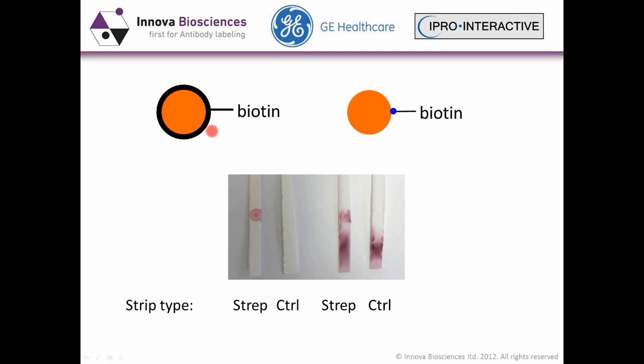This is an example of Innova coat biotin gold versus a ligand self-assembly biotinylated gold. We have a streptavidin spot on the nitrocellulose versus a control with no spot. The biotin gold binds to the spot very cleanly with no background. Whereas with the self-assembly, where dissociation or destabilization occurred, you can see the aggregation and purple color of the gold even before it reaches the spot — and even on the control, there's significant aggregation. This can be reduced somewhat by optimizing buffers, but the difference is clearly visible here.